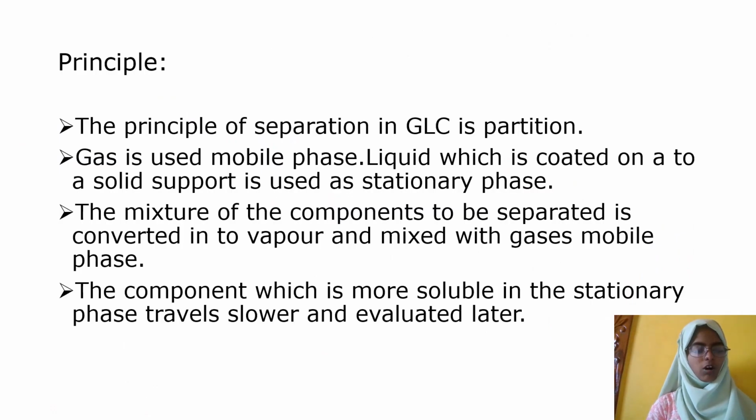The basic principle of gas chromatography. The principle of separation in GLC is partition, meaning to separate. Gas is used as the mobile phase and liquid coated onto a solid support is used as the stationary phase. The mixture of components to be separated is converted into vapor and mixed with the gaseous mobile phase. The component which is more soluble in the stationary phase travels slower and is eluted later.